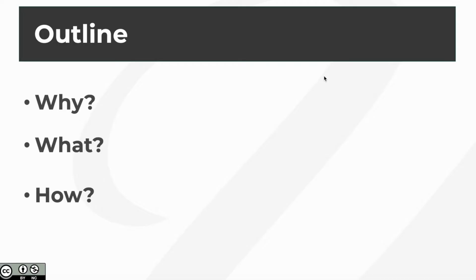This talk will revolve around three interrelated sets of questions. Why is quality control and documentation important? What do we need to do to ensure appropriate documentation and quality control? And how can we carry out these procedures in practice and without compromising scientific productivity?